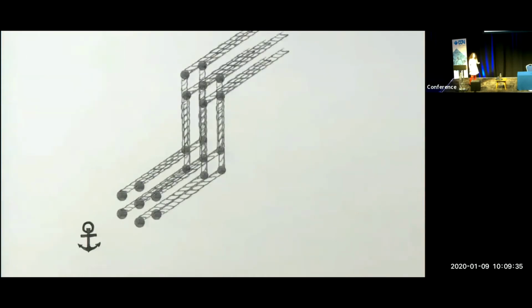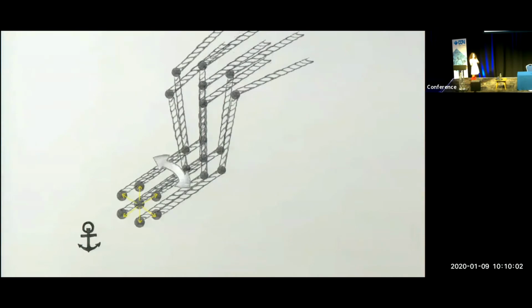of the structure. Now, this completely accounts for the positional information of the protein, but what about the flexibility? Well, then we go and think about the list of explicit atom positions, and we take each sister position, and we can define a relationship between the sister position and the average atom position for that atom. And we can use that relationship to define a deviation in the torsion angle, which is then propagated to either the N terminus or the C terminus.